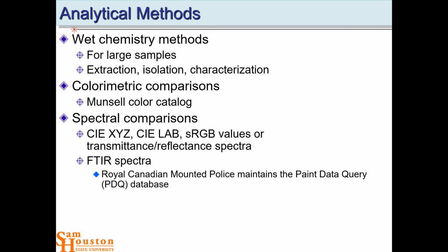And so then you can go through and take slices of that spectrum and look at it in terms of its coordinates. So if you want to think about a fingerprint, there's going to be protein in that fingerprint, and proteins have carbonyls. So if we imaged and took a spectrum at every pixel, we could then pick the carbonyl band, 1600 wave numbers, and we would image where the protein is. And we would see that fingerprint. It would show up. So that's hyperspectral imaging. The hyper meaning you've got spectra at every pixel. So it's just very data intensive.